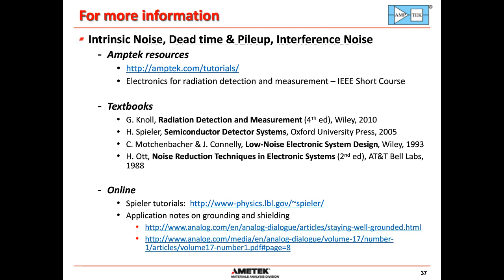What's the input and output count rate presenting recorded data? I'm not quite sure what that means. I'll discuss that one separately. There's an input rate, and that can be up to 10 million counts per second, and then there's an output rate that follows from that. All of that goes into the spectrum, and that's acquired over time and read out by the spectrum.